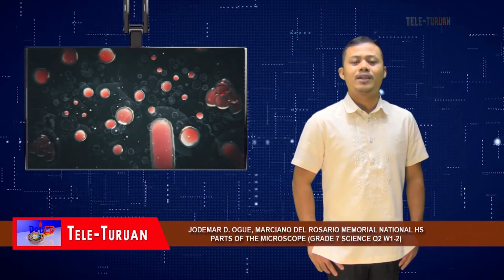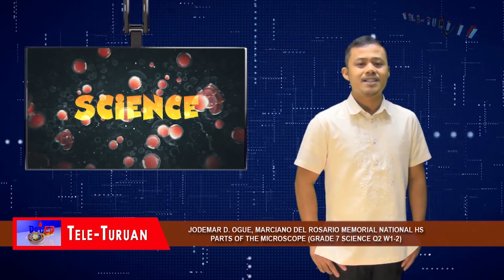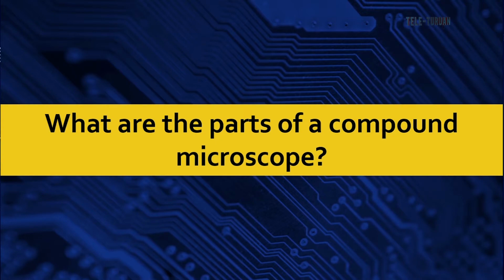But before we go to electron microscope, we need to study the basic. Let's start studying a small one, a compound microscope. Let's study its parts and functions and how to focus specimen under this type of microscope. What are the parts of a compound microscope?